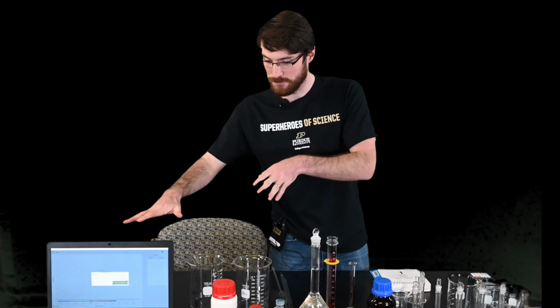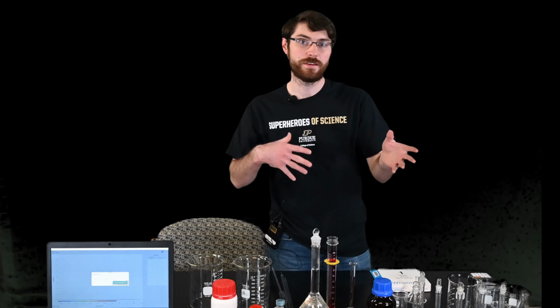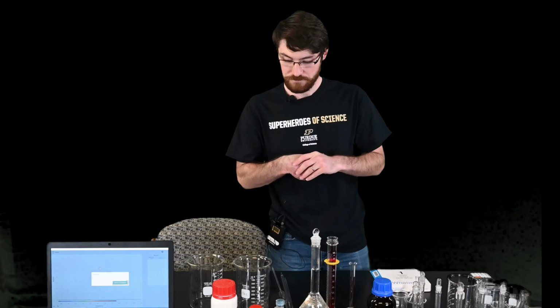We have our instrument, right? So today we're going to be using a SpectroVis Plus. This is going to be communicating with our laptop here, and we'll be able to record UV-vis data using that instrument, but of course any other UV-vis will work as well.